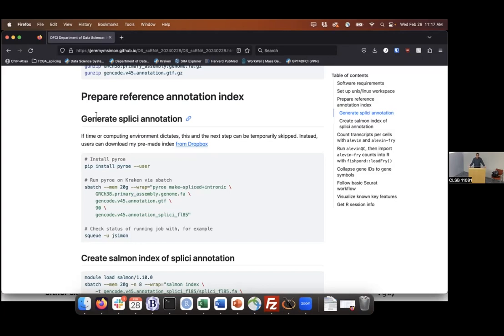The other thing to keep in mind is that if you have two samples processed completely independently, you may have two cells, one from each, that have the same barcode sequence, but those are not the same cell. They're derived from different tissues, and it's just a random event that they got the same barcode sequence. Those shouldn't be combined, because we know them to not be the same cell.